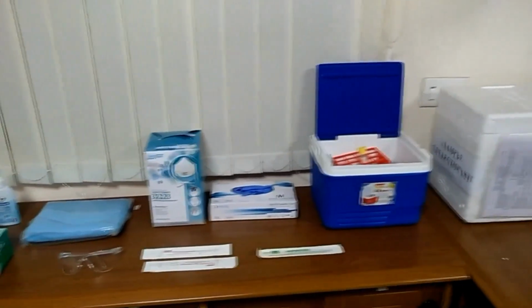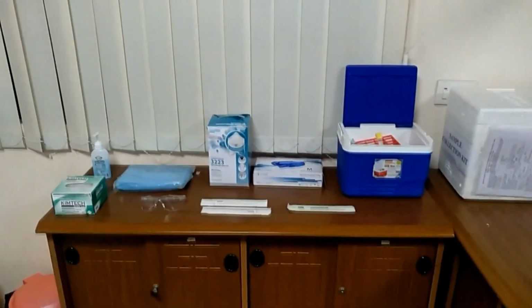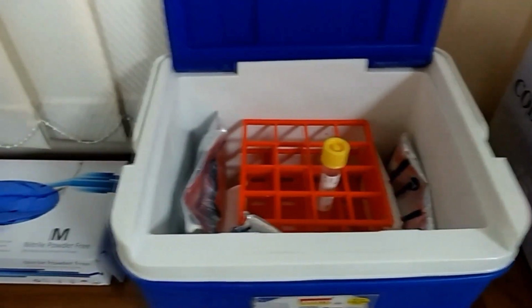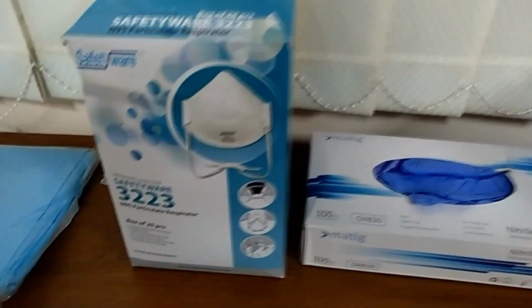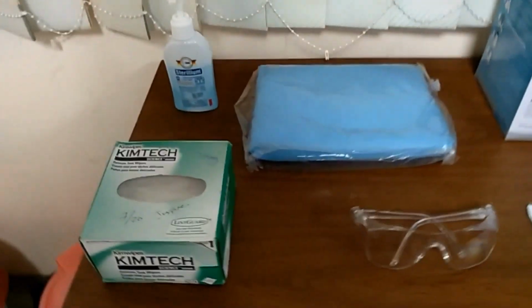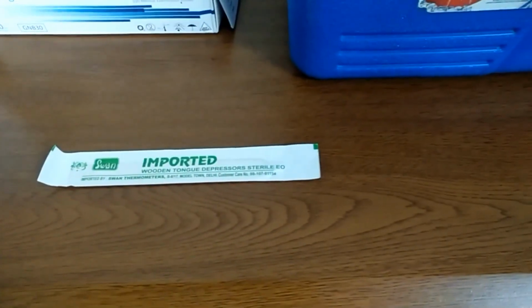The materials may include soap and water or alcohol-based sanitizer, appropriate mask or respirator, disposable gloves and gowns or laboratory coat. For eye protection, you may use face shield or goggles. Keep waste bags for discarding contaminated biowaste. Marker pens for labeling and tissue. For sample collection, keep appropriate swabs and a cool box for holding the sample after collection.